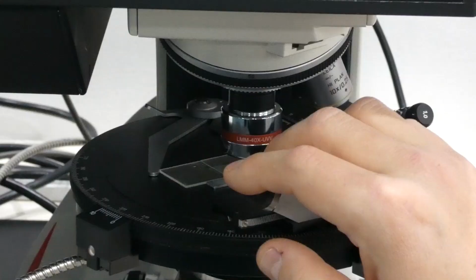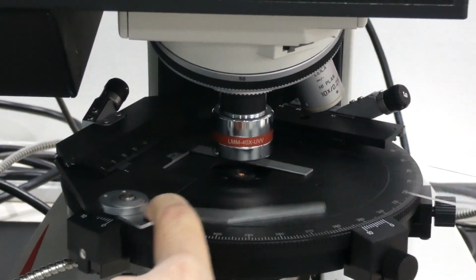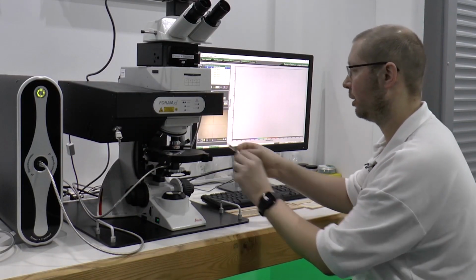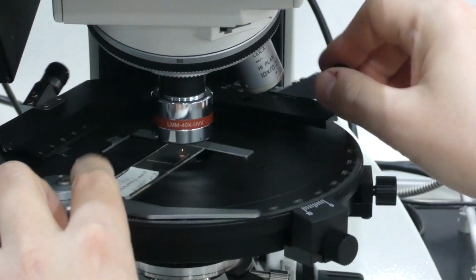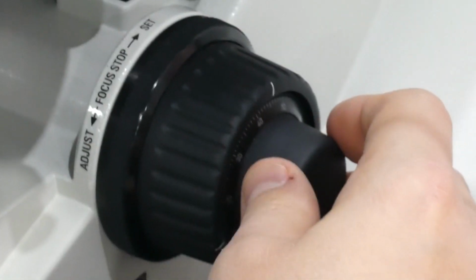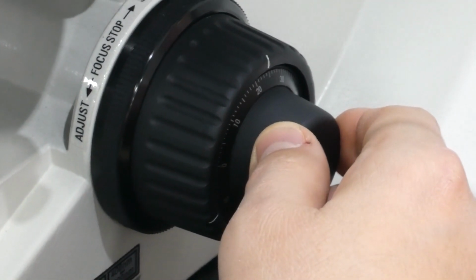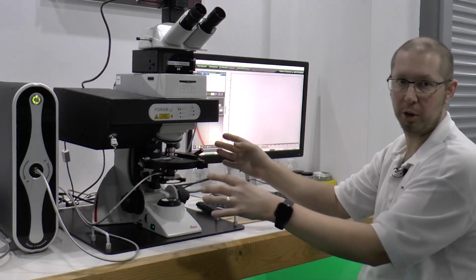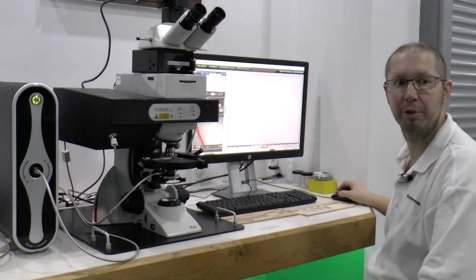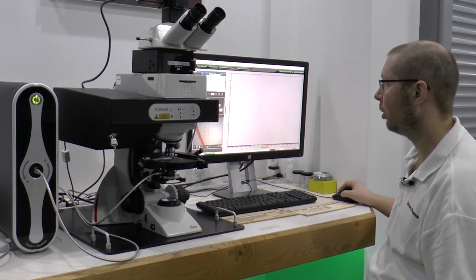Okay, so once we've recorded our repeat measurements for the control fibre, we're now going to place in our sample already prepared for the questioned fibres. So we just need to swap the samples over, and then we need to find those on the slide. There we go. Get that in focus. Because we've now swapped the sample over, we would now need to record the white and dark reference measurements again before we start taking our spectral measurements of this fibre.